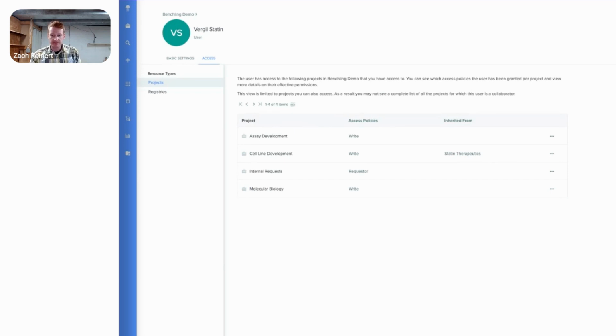So again, in a quick summary, you saw how we can manage handling data, thousands, tens of thousands, even millions, or even billions of results, all on a single platform. And I'm not running a supercomputer, I'm running a laptop. Again, we also saw how Benchling makes it easy for administrators to check permissions on given users and make sure that data is secure across all the different projects.